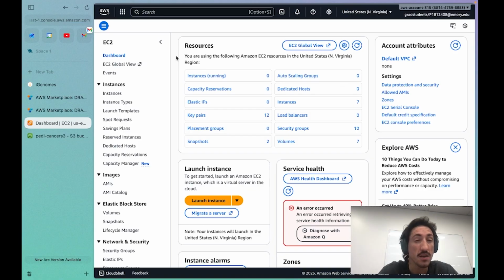Okay, so you just did your cut and run experiment and you have your raw sequencing data back. The first step we're going to need to do is align that DNA to two different reference genomes, both the human and the E.